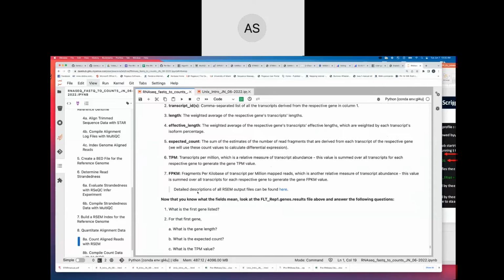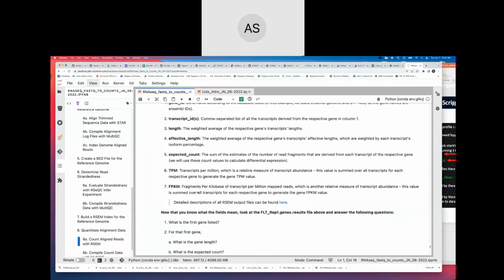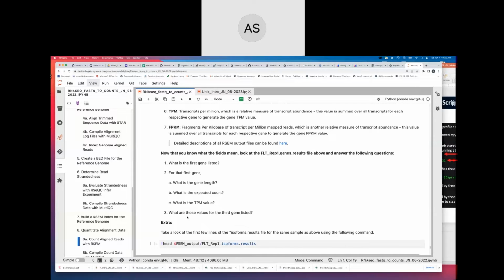Oh, you looked it up, Alba. How could I not? It's number 1. We're going to add annotations in the DGE portion with Lauren, so we will convert all of these Ensembl IDs to gene IDs and symbols that make more sense.